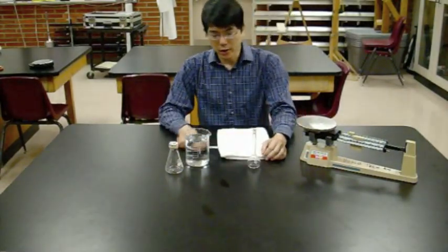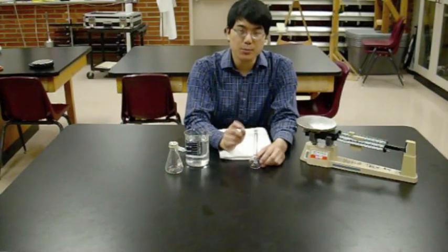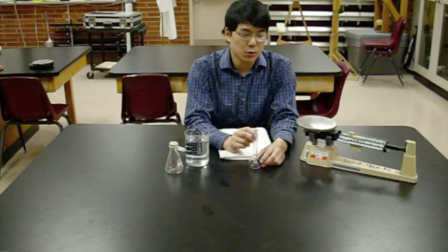The goal of Part 2 is to measure the volume, the mass, of 50 milliliters of water. So you need to have a device that can very accurately measure 50 milliliters of water.